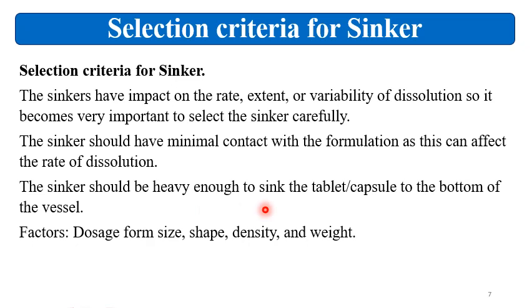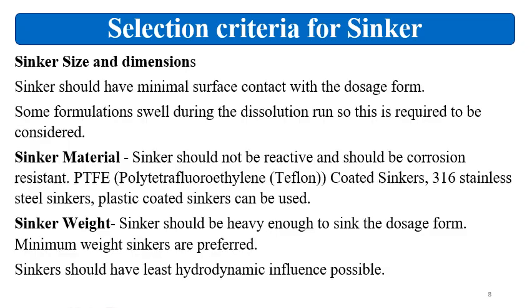The sinker should be heavy enough to sink the tablet or capsule to the bottom of the vessel. If you have selected a very light sinker compared to the formulation, then it will give variation in the tablet landing. So factors like dosage form, size, shape, density and weight are considered whenever sinkers are selected.